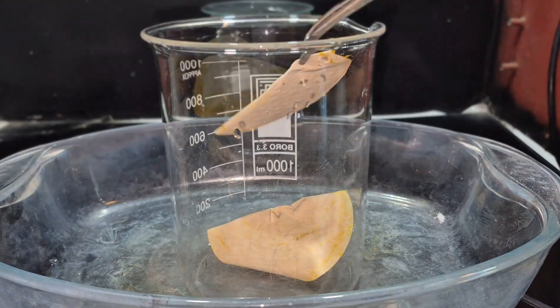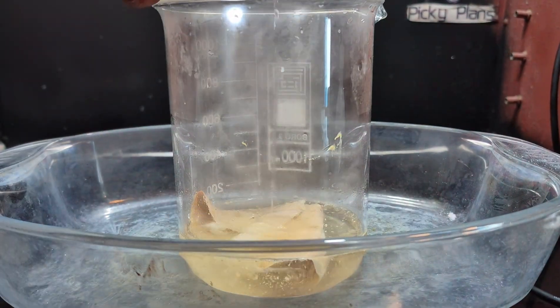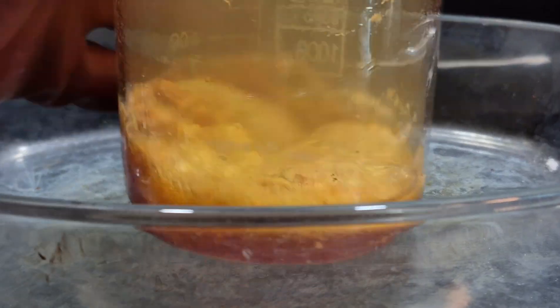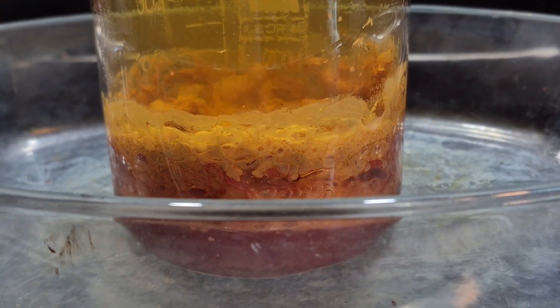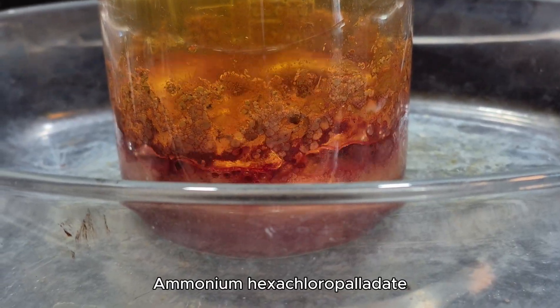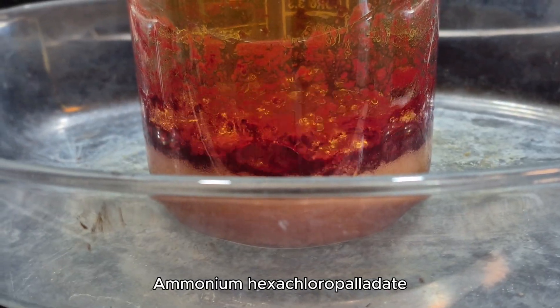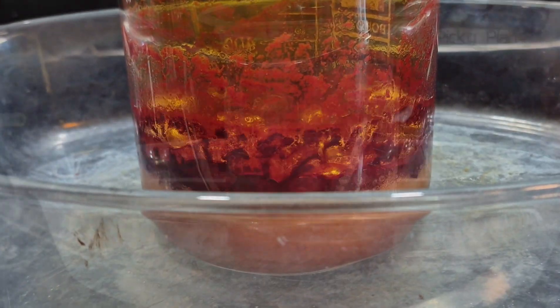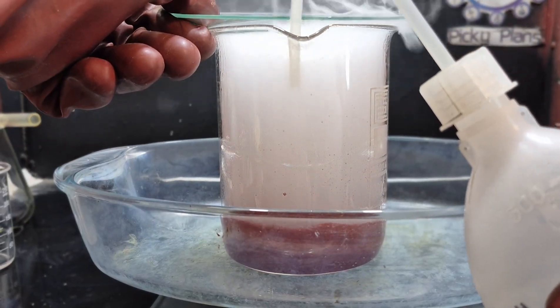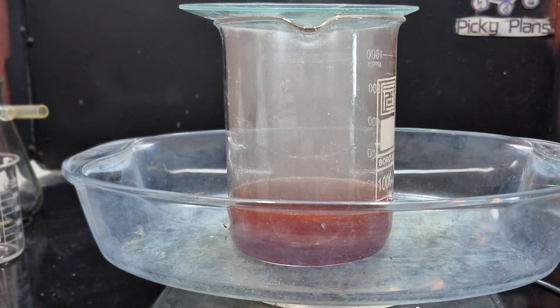Now I'm going to reduce the palladium DMG complex to metallic palladium. I started dissolving it using aqua regia. Ammonium hexachloropalladate, a deep red salt, formed due to the ammonia contamination in this solution, but it dissolved after further boiling. After the solution settled, I added some ammonia to dissolve any remaining palladium salt and then filtered the solution.